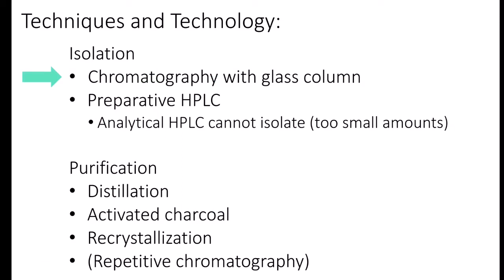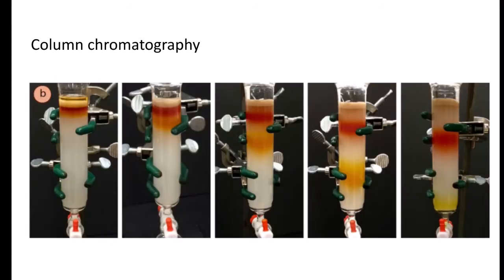So let's go to the first one in our list, chromatography using a glass column. This is the traditional method, and it is shown in this photo. So this type of chromatography separates components according to polarity. As you can see, the colored bands on the glass column represent different compounds. So may compound na mauunang lumabas from the column and it can be collected first, then wait for a little more before lalabas yung second compound. So that is one way to separate and isolate compounds.